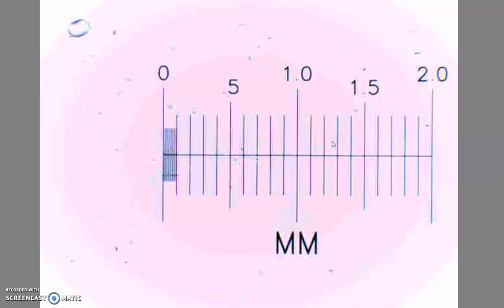So our diameter at 10x in this example, again, remember, your microscope will not be this small. It'll be bigger than this. Ours was 1.3 millimeters, which means times 1,000, that would be 1,300 micrometers that you would be converting for. So you should be able to know how to do that as well.